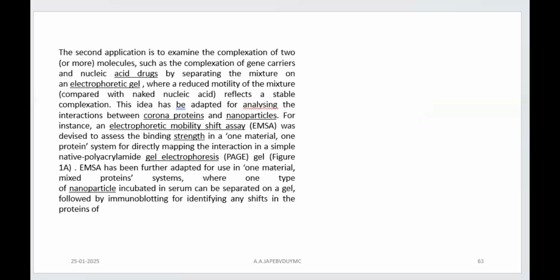Of course, when you talk about electrophoresis for nucleic acids, it is used for their separation on the basis of size, and for finding out their structural and conformational details, that is single stranded DNA, dsDNA, and circular DNA. The mobilities are going to be different. Again, with the help of a ladder, you can estimate the size of the fragment, right?